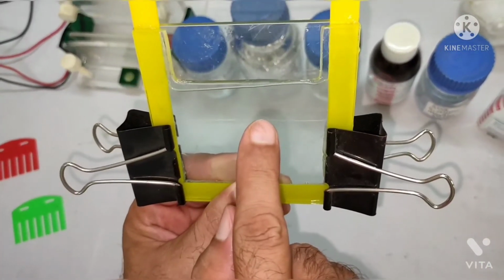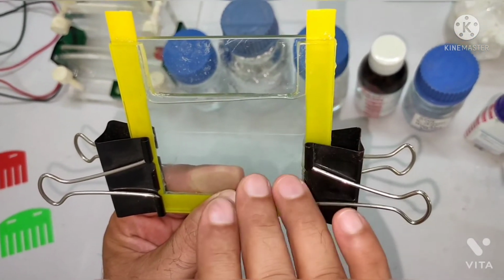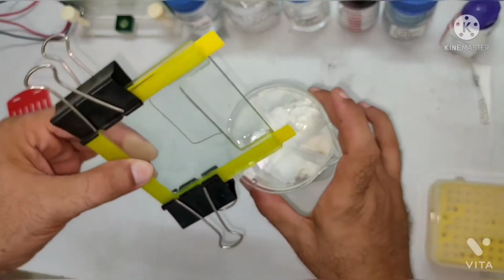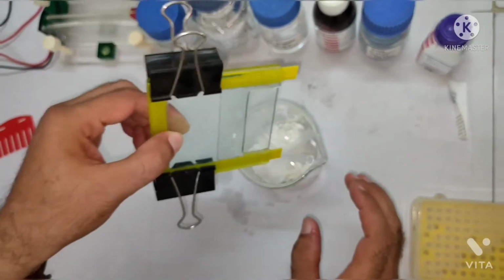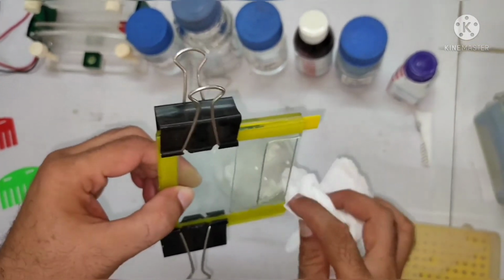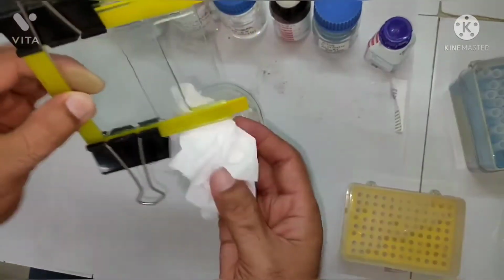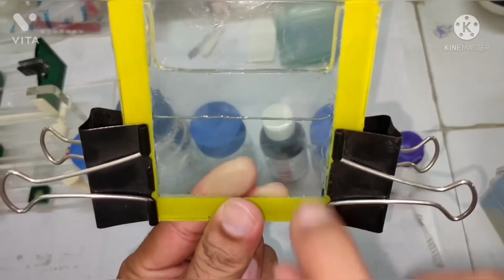And why did we add water? Because water breaks the contact of the gel from the oxygen or air, and that's why it polymerizes. So now we just discard the water. See, we discarded the water. You can also add butanol, depending upon your requirement and what chemical you have. Water is available everywhere, so you use water. So now you can see, our separating gel is ready right here.